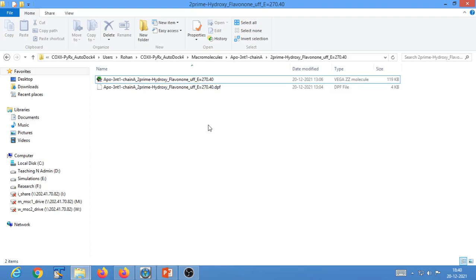That is where our discussion begins. Now I will tell you what is the exact issue with obtaining the complex, or what are the difficulties that you might face when you want to generate that COX and flavonoid complex.